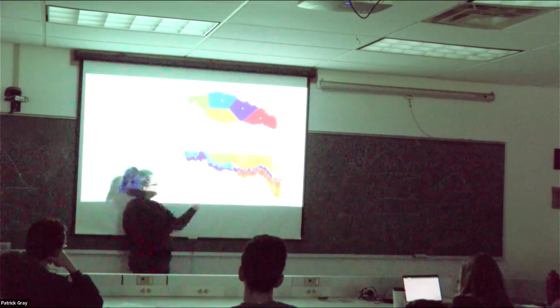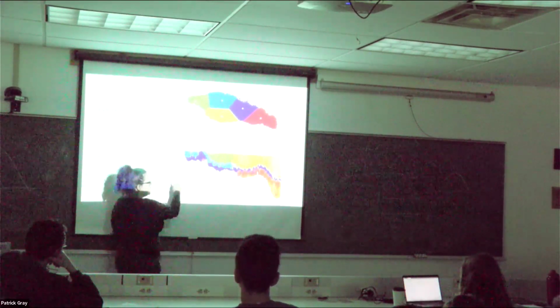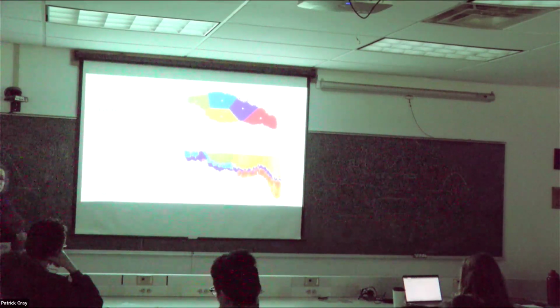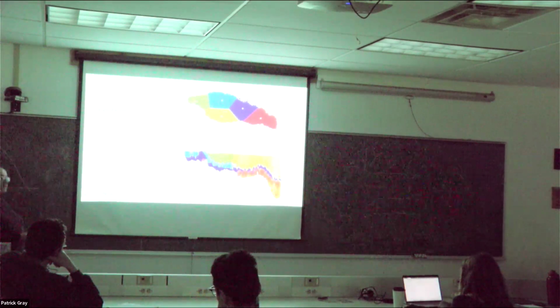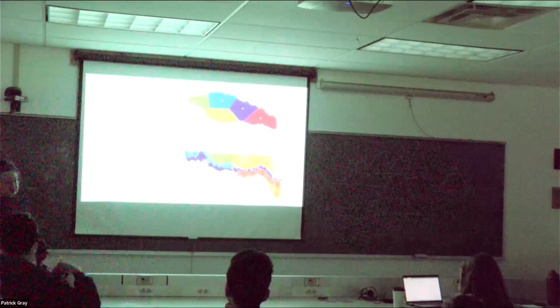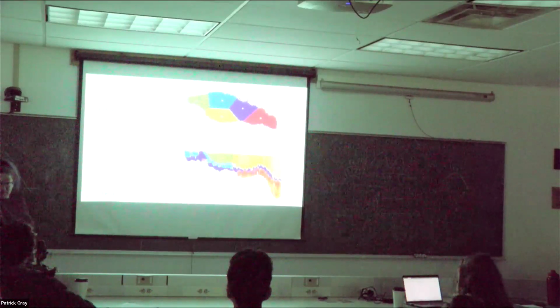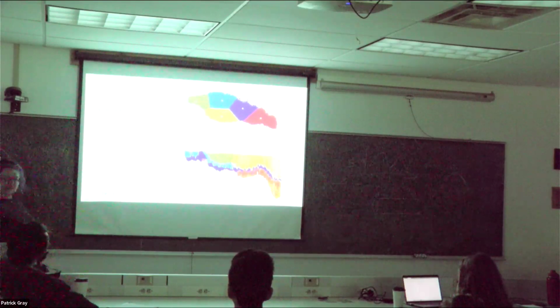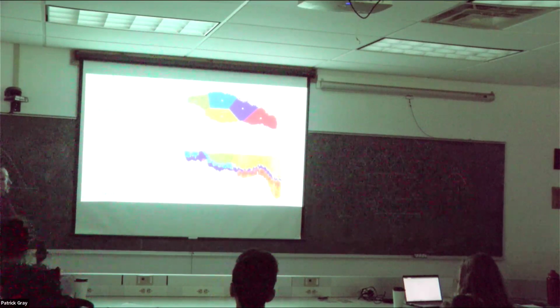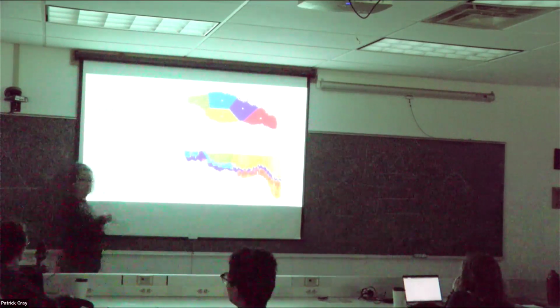And then when they plotted it as a function of their glider profiles over a period of time, you can separate really nicely the different types of water masses. So for example, if you need to separate your different samples, you can use these tools. Maybe it's not quantitative, maybe it's not great, but it can separate different water masses in your sample. And that's awesome, because it gives you a step further down to differentiate different ecosystem states and processes. This could be upwelled water, this could be river plume, and so on.